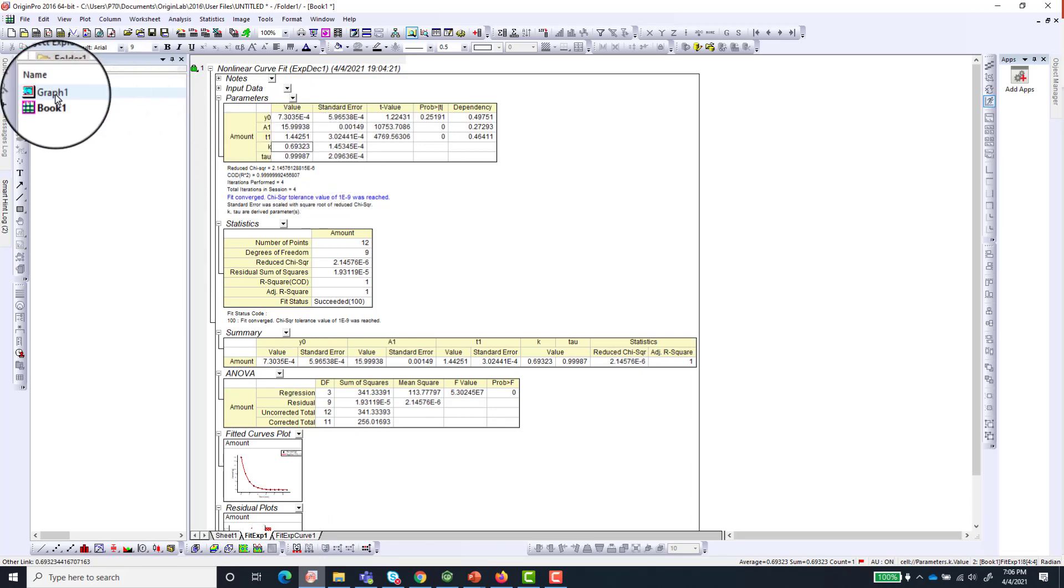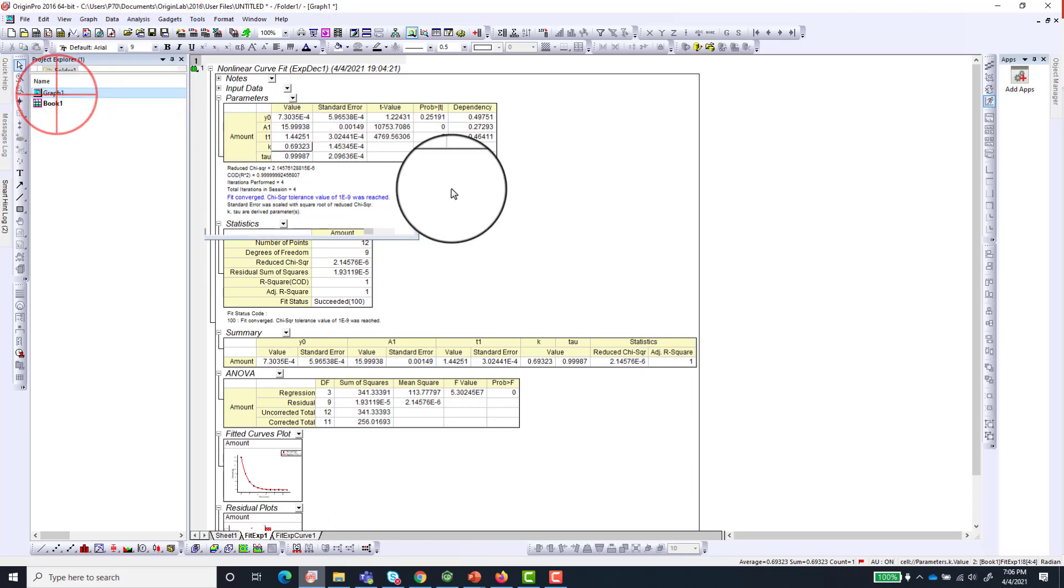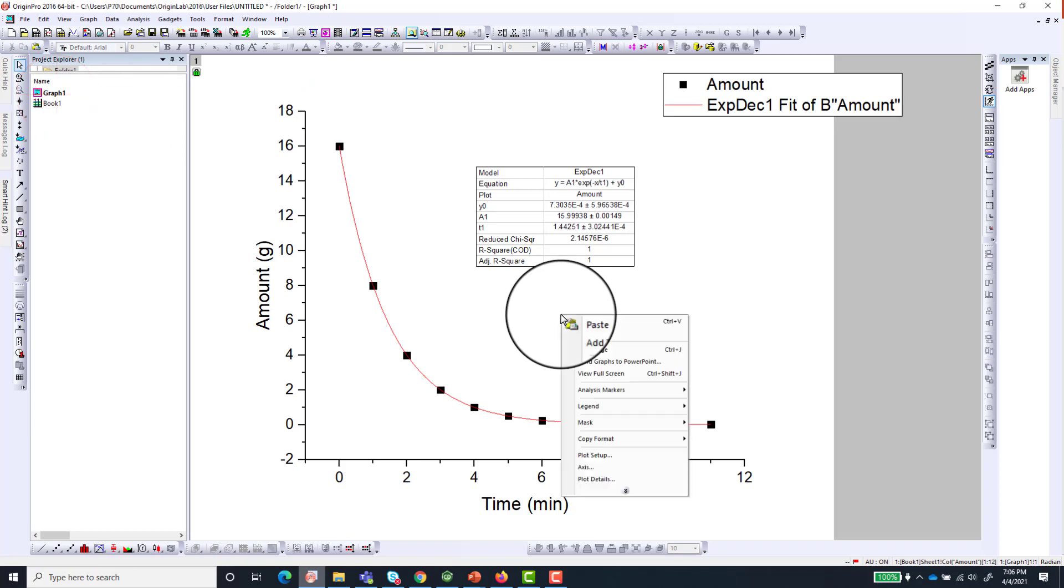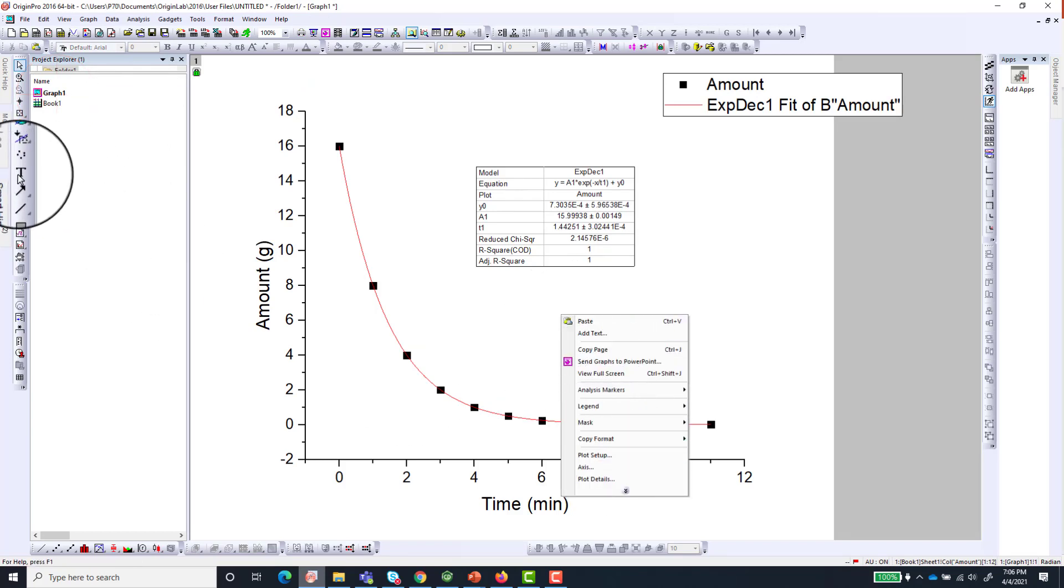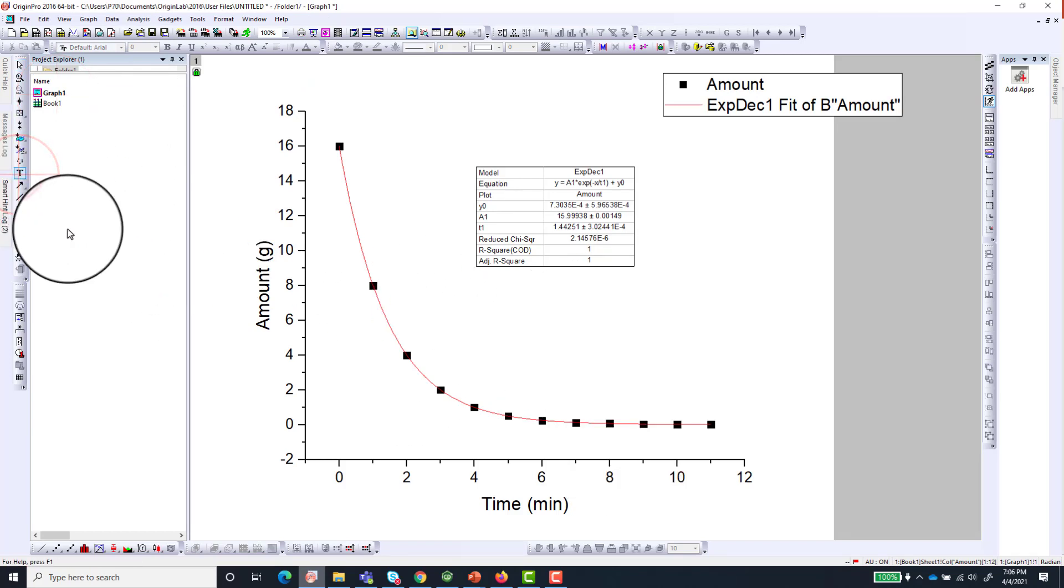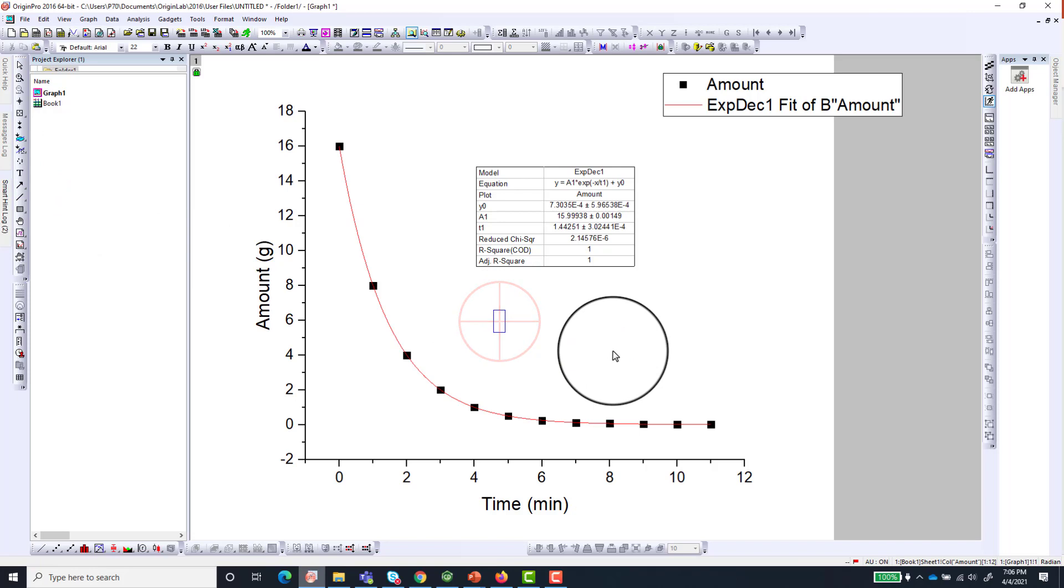Copy that and you can put it on the graph. And say put a text, say k is equal to this. Okay.